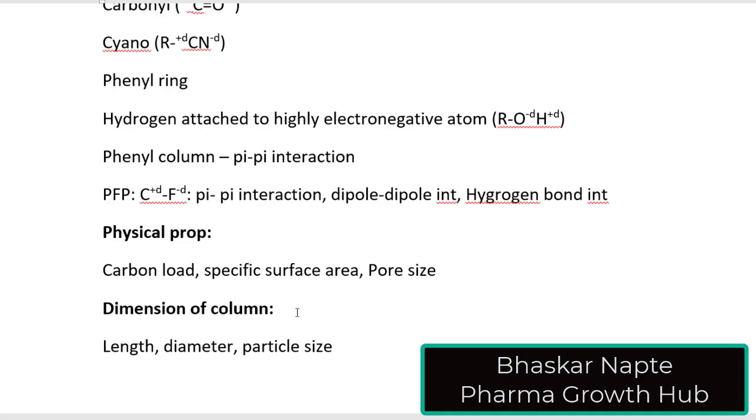And nowadays there are columns available with around 2.1 mm inner diameter. So in case you are stuck at a critical separation, you can think of these HPLC columns with a reduced diameter. Particle size also has a similar impact. The lower the particle size, the better the resolution, efficiency, and plate count. So with these three important dimensional parameters, you can make the interviewer clear that which column I select will depend on the number of compounds to be analyzed or the complexity of the separation.